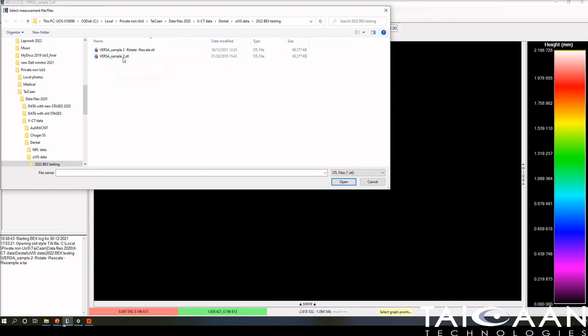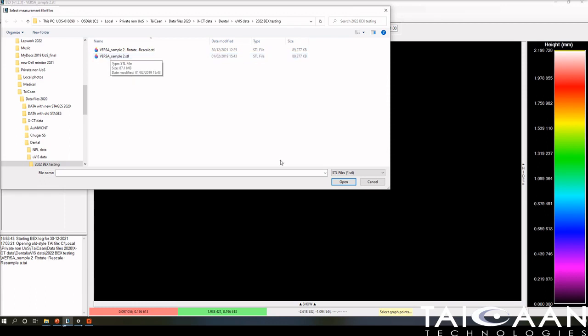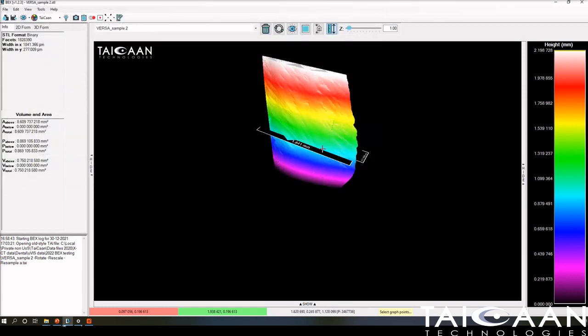In the standard Windows window, I have to click STL, and here you can see Sample 2. This is the sample we're using, around 90 megabytes of data. If I clicked this, it would load directly into BEX. To save time, I've already done that, and this is what you get.